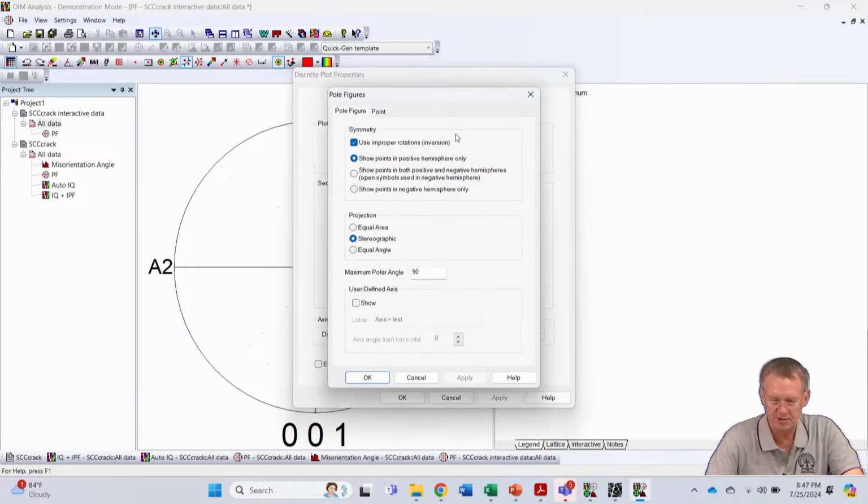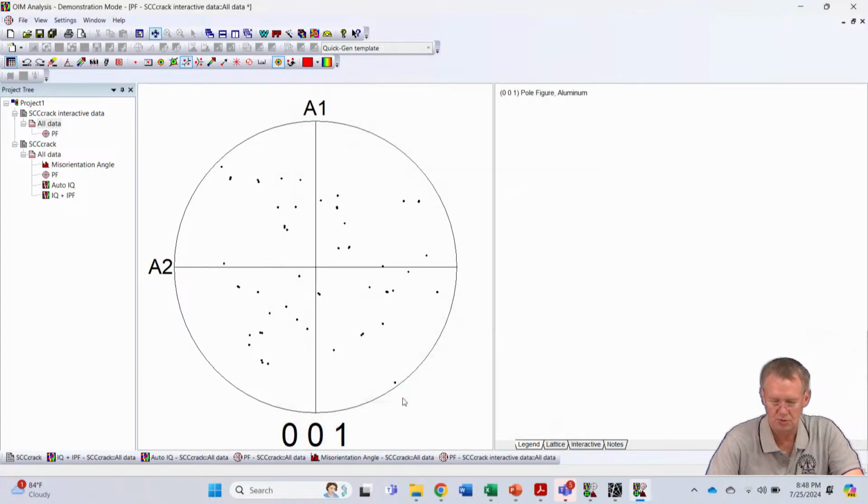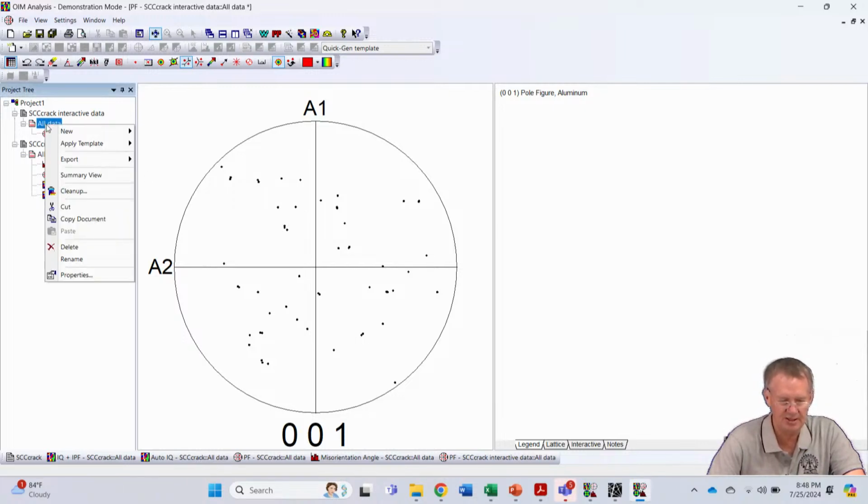Okay, so what it's doing is it's giving me only the... and this one is giving me only the orientations that I've clicked on instead of the misorientations, which I was trying to show you here. So it doesn't give me an option to do that.